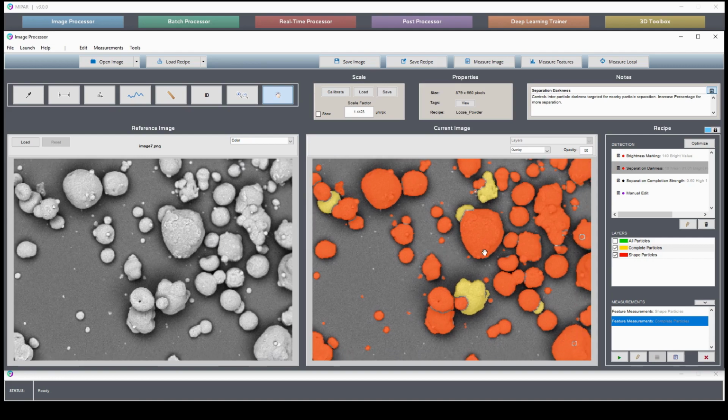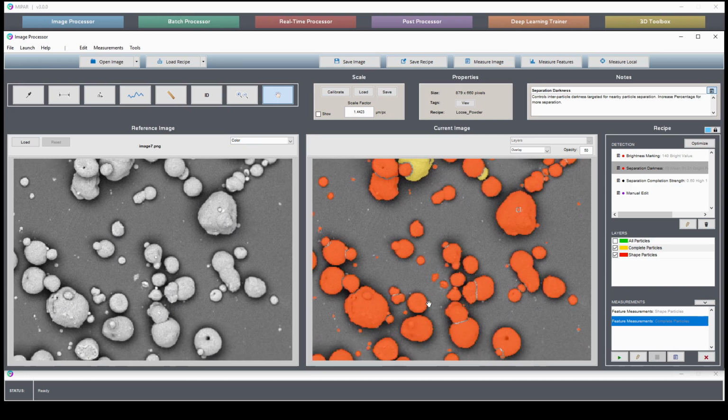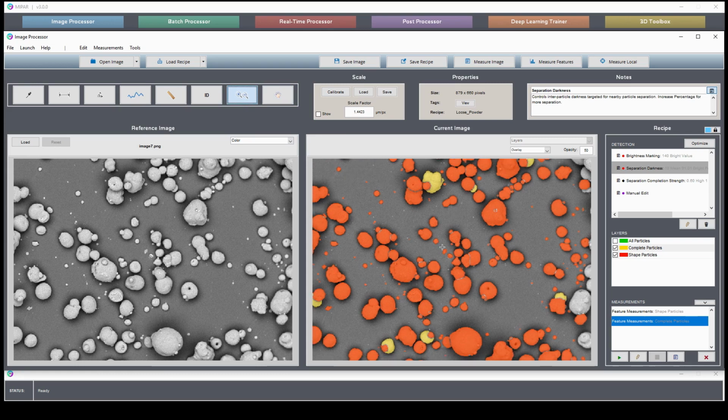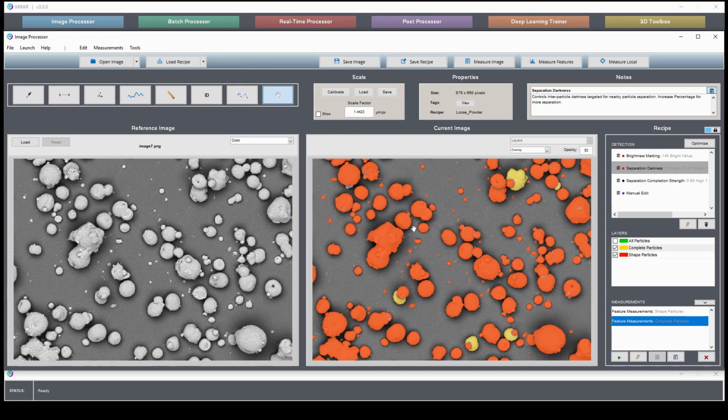But as mentioned with the grains, with the advent of deep learning technology, you can make your manual adjustments and then, in this example, train a second generation recipe based on those adjustments that only becomes more robust as often as you use it. I'll be clear that this particular solution was put together without deep learning. If required, a deep learning component can be added if needed to meet your project requirements and your level of required robustness.